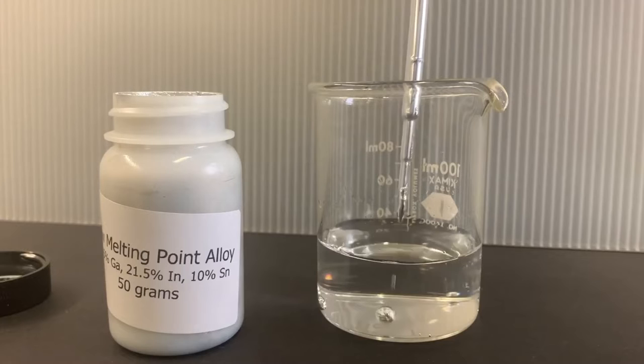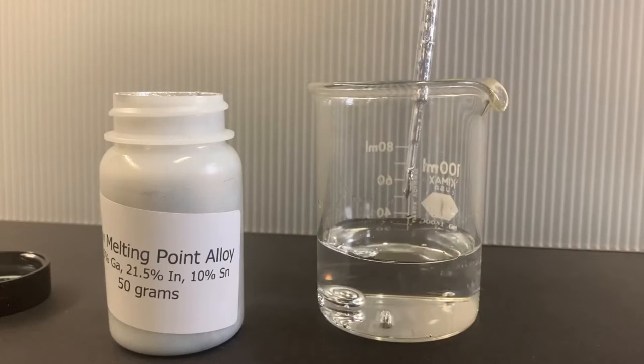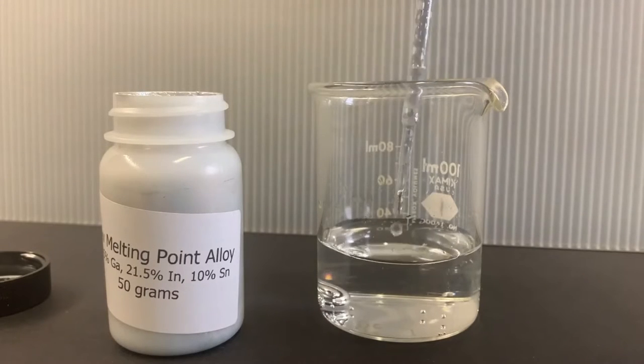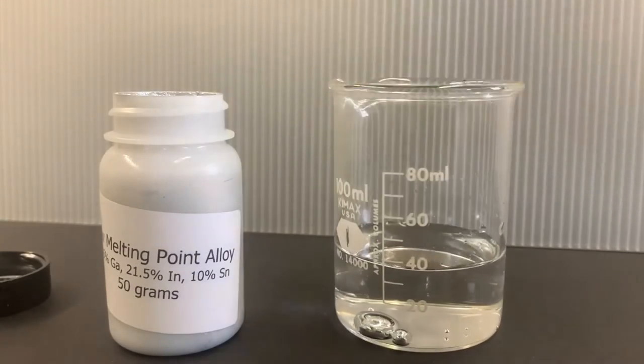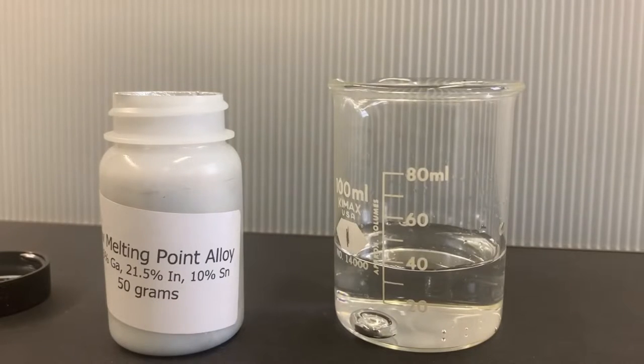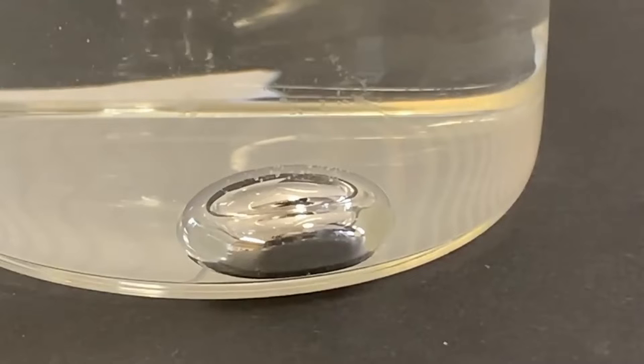I'm going to try to use gallinstan in place of mercury in the classic mercury-beating-heart experiment, in which a drop of liquid mercury is made to pulse, just like a beating heart. Let me show you how this experiment works.